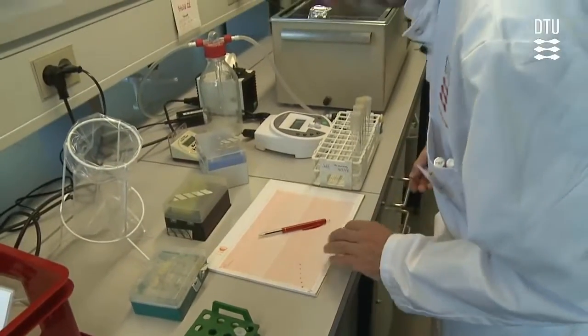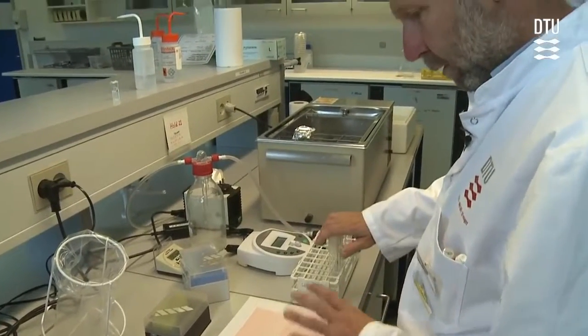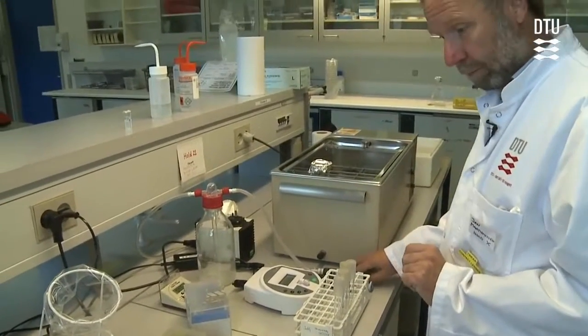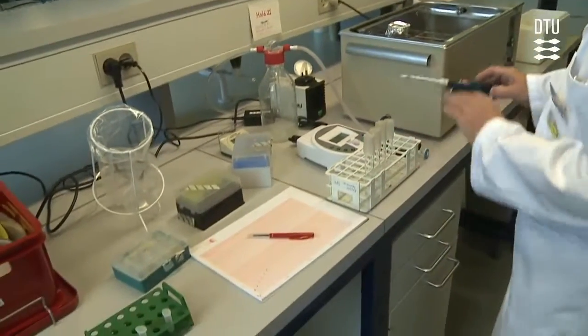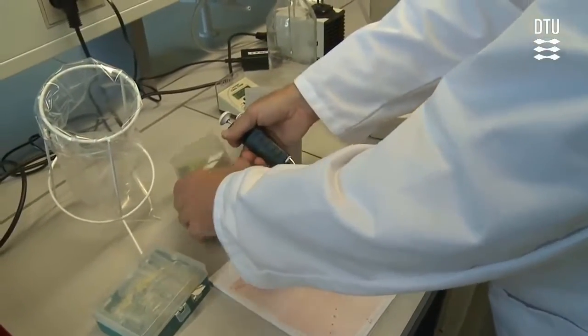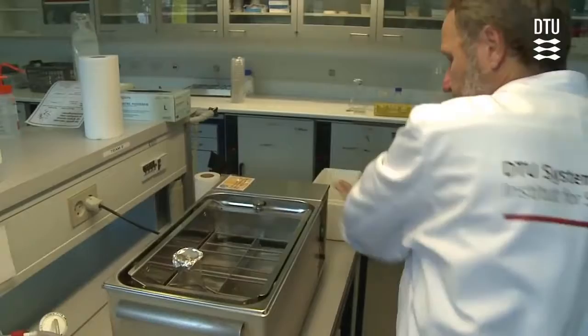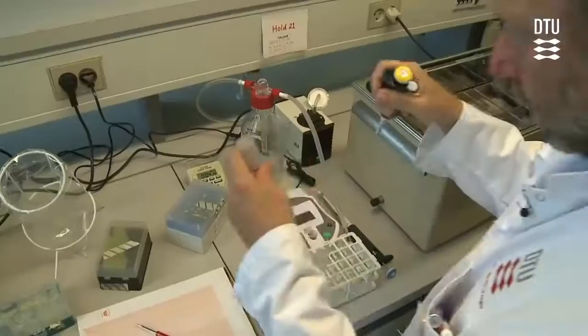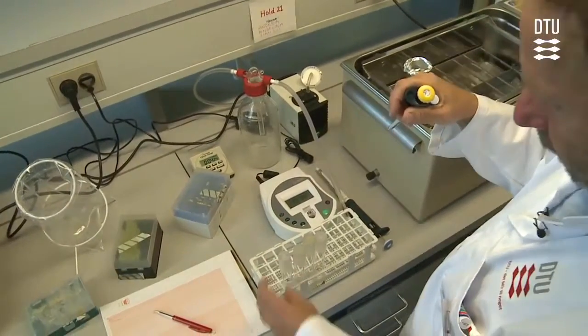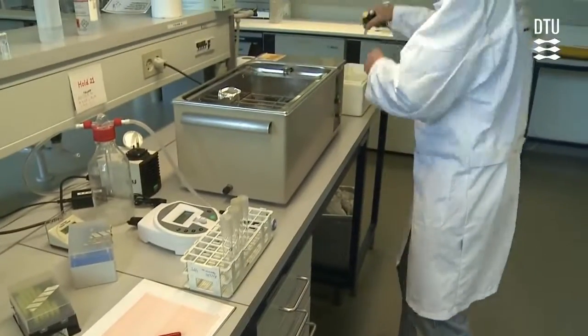We have now reached an optical density of 0.3, so it's time to add the penicillin. But before we do that, we have to take a sample and determine the density of the culture, or the CFU in the culture. We take a sample of 0.1 milliliter from the culture and add that to a 10 milliliter dilution tube. From that we then dilute the sample and plate at the proper dilution.